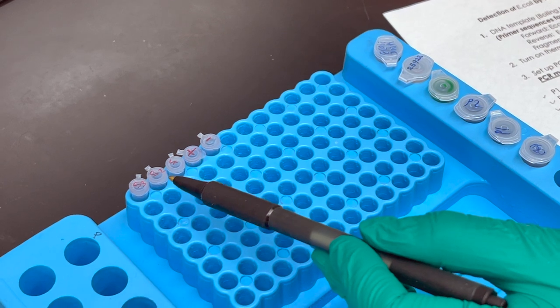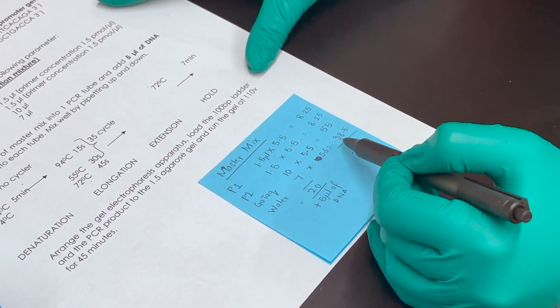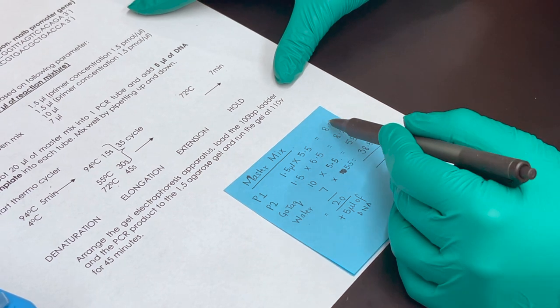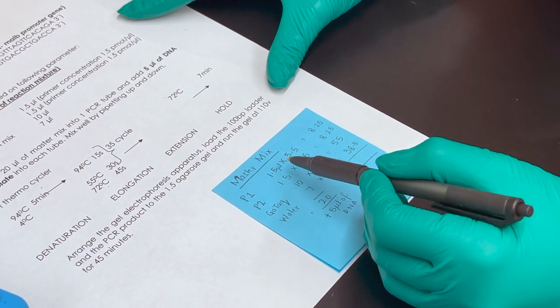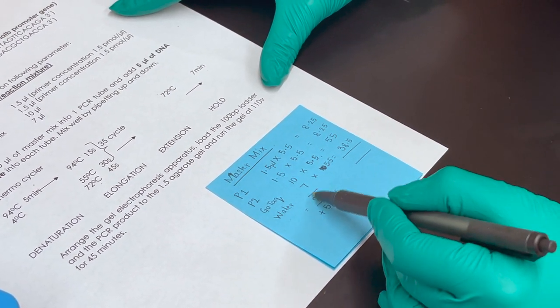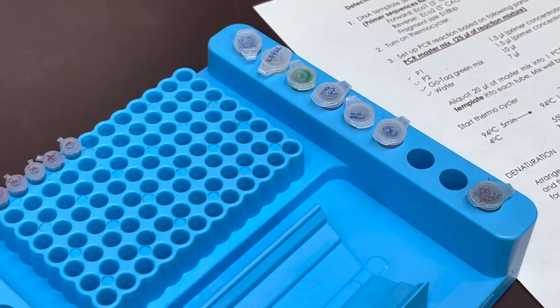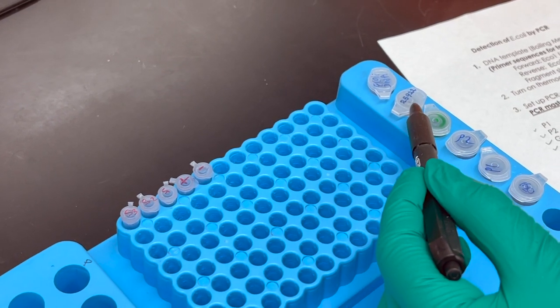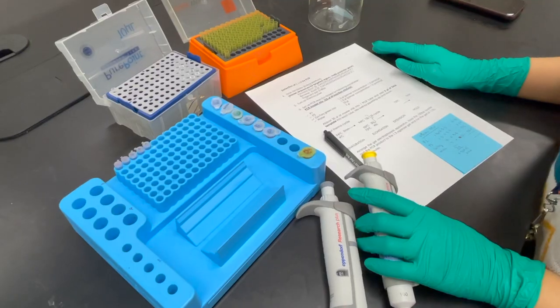Since we have five samples, we need to prepare a master mix for all five together, so we multiply each volume by 5.5 — keeping a little extra of each reagent. From the master mix, we will extract 20 µL into each of the five tubes, then add 5 µL of E. coli DNA to the sample tubes. The positive control gets 5 µL of positive control DNA, and the negative control gets 5 µL of water.